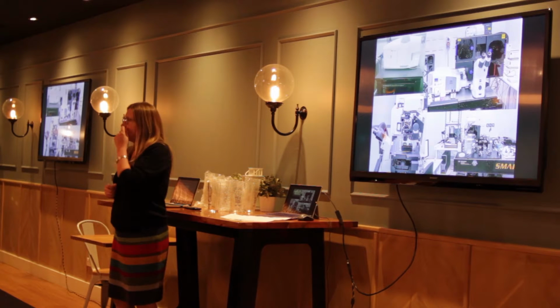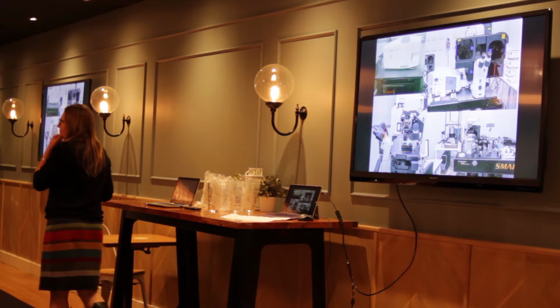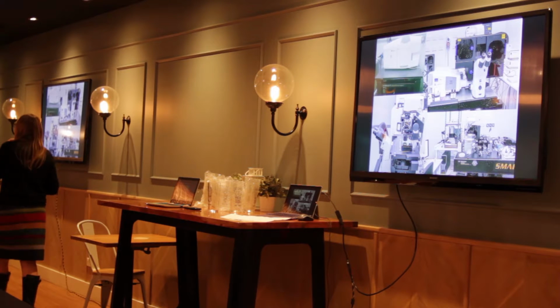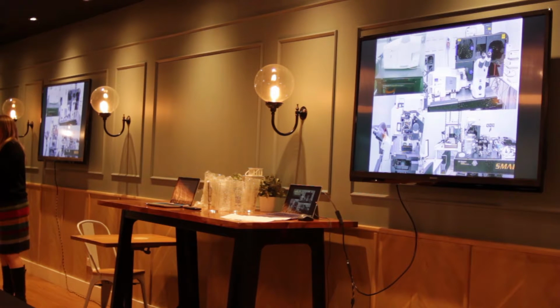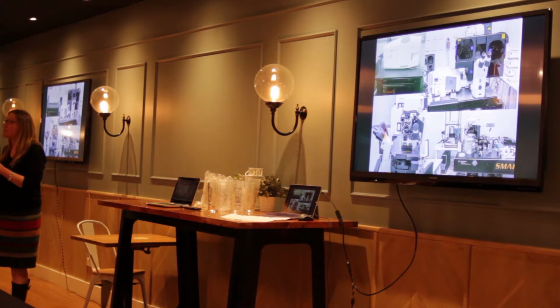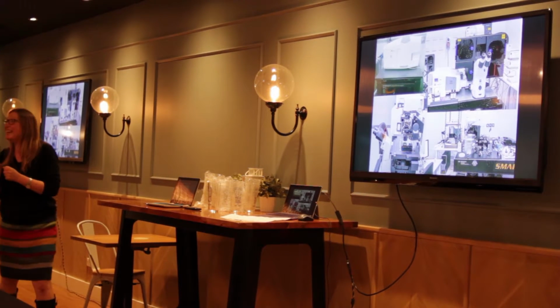One up the top, that's my new baby. That's called a light sheet. Okay? I can make 90 terabytes in a day. Okay? It's pretty cool. But it means it's pretty expensive. It's not quite JPEG.